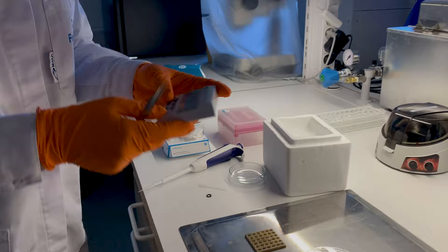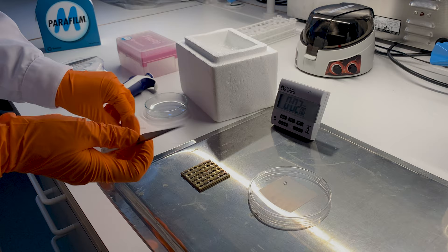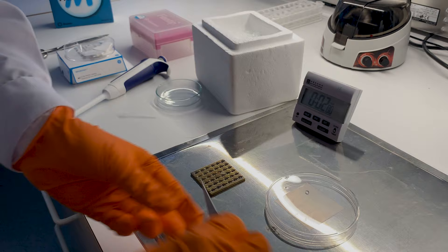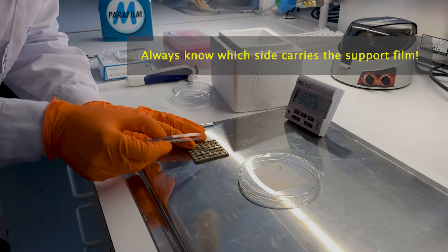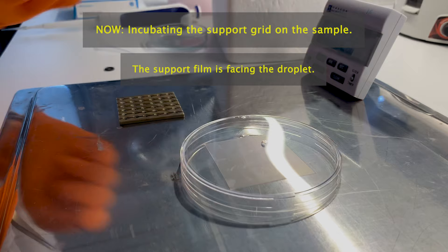Now we can place the grid onto the sample. I typically start with two minutes incubation. There are two ways you can do this: you can place the grid onto the droplet on the parafilm, or you can hold the grid in the forceps, close them with a rubber band, and then apply a droplet to the grid with a pipette. But I prefer to do it on the parafilm. Remember that the support film was facing up, so we have to flip it now so that it faces down towards the sample. We just leave it like this and start the timer — two minutes.